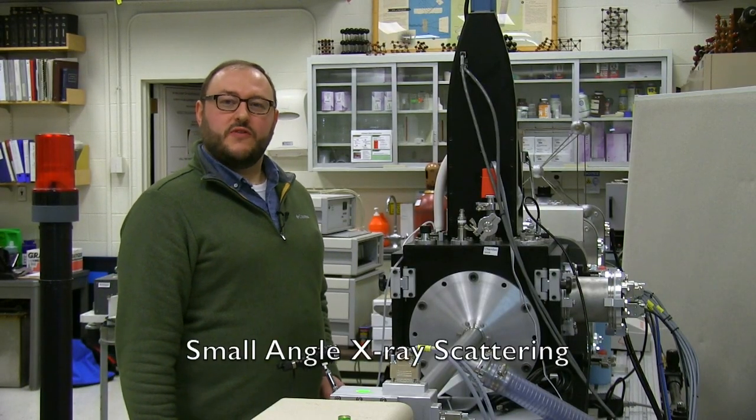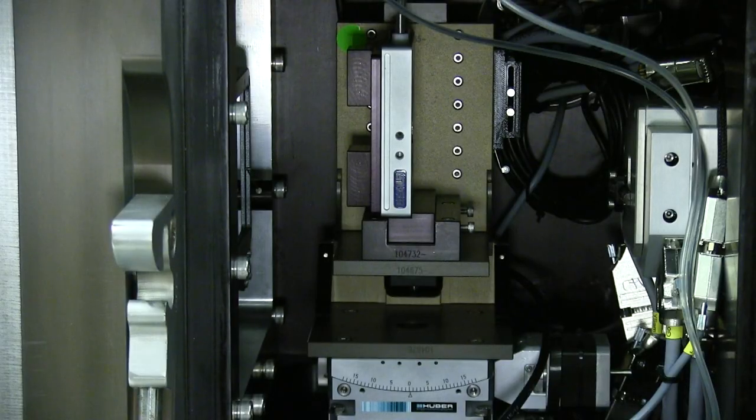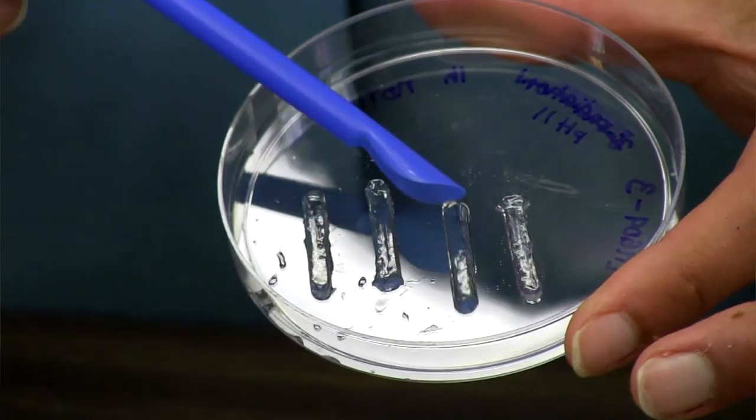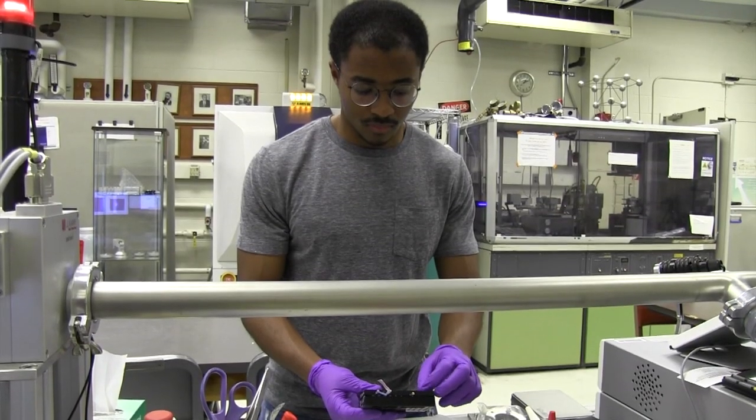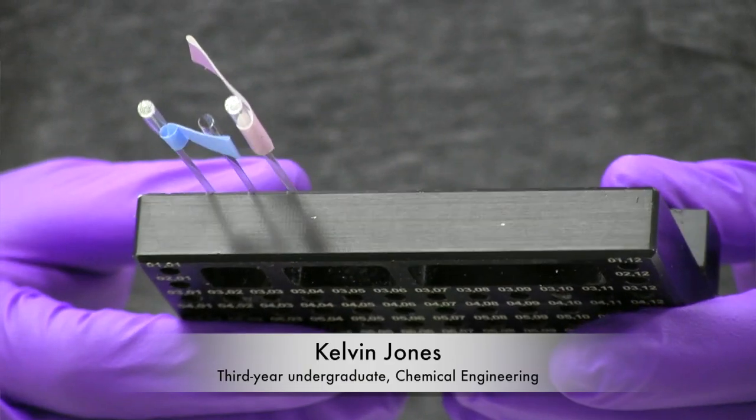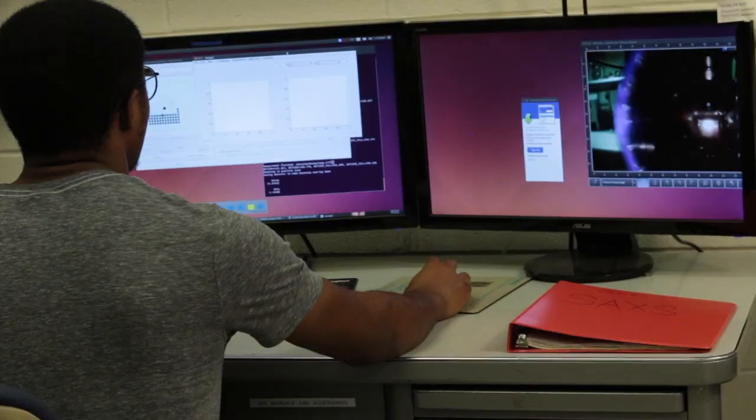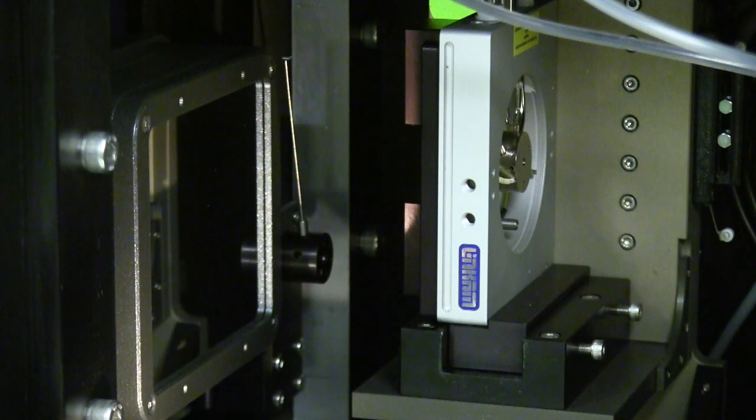Whereas most of the equipment in the facility is targeting hard materials, small angle X-ray scattering equipment characterizes soft materials. You can learn about the structure of a material not on the angstrom scale, but on the hundreds of nanometers scale. The beam stop that looks like a clock hand rotates into position in order to block the main X-ray beam and allows us to see the scattering very close to the main beam.